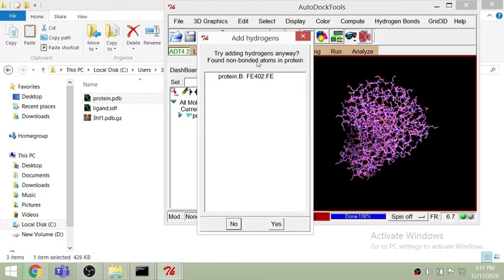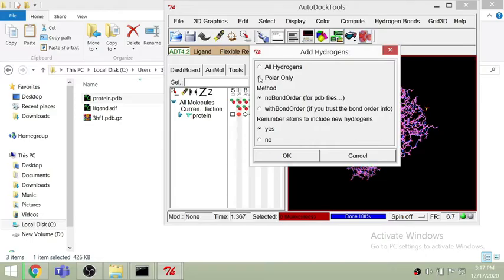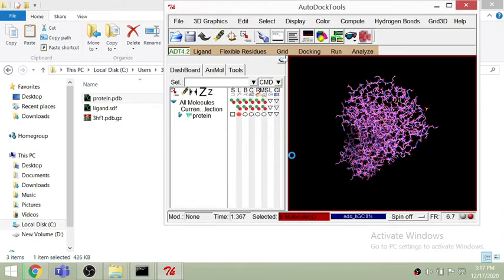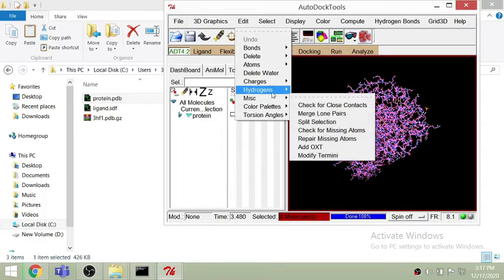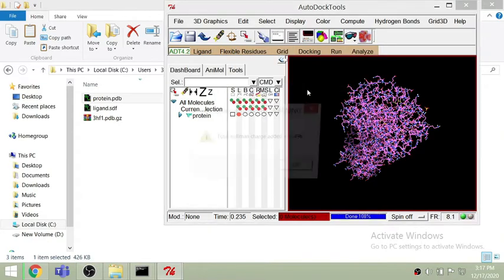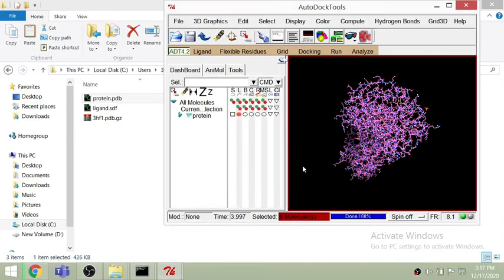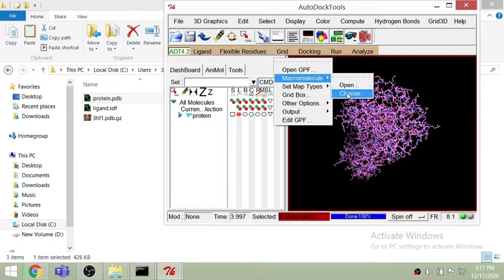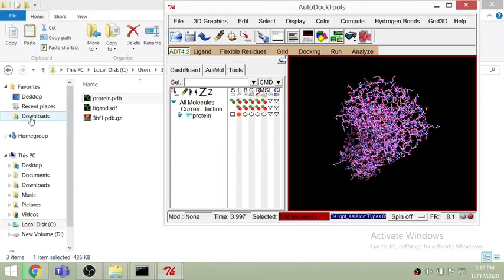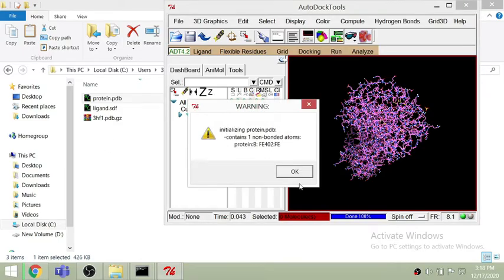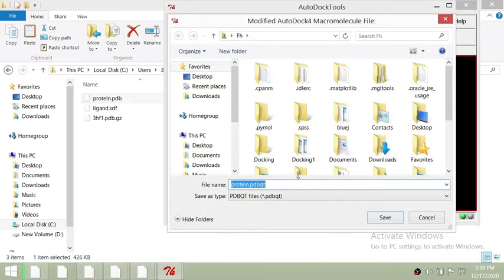I am adding all the hydrogens here. Just click yes and select whatever options are appropriate. Here I am selecting polar hydrogens. Now all these are loaded. Next, I am adding the Kollman charge. You can see in the structure there is a difference — now the charges are added. Next, select the protein module. These are the steps you have to do before saving from the AutoDock tool. It's initializing the PDB and things are done.